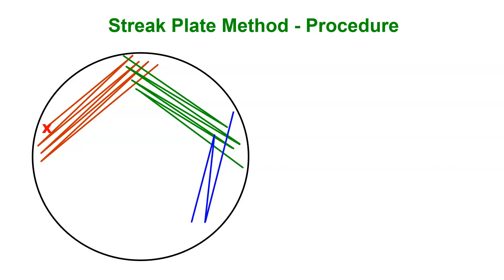Then you're going to go back and you're going to flame again. You're going to put in a new set of streaks. And go back and flame again. And now you're going to put in another set of streaks. What you're doing is every time you're diluting it, because you're spreading this material out, you're only picking up where you get the intersection. A very simple process.